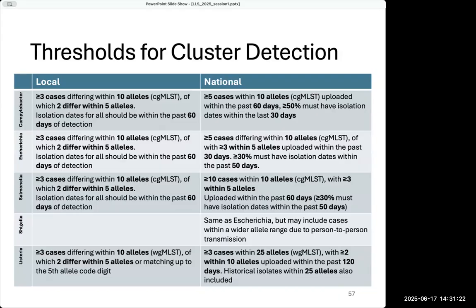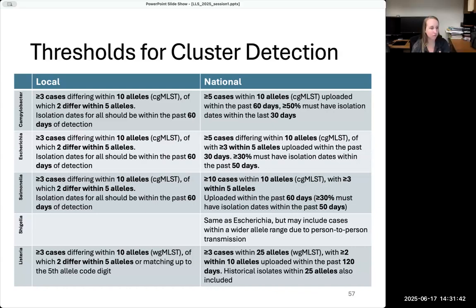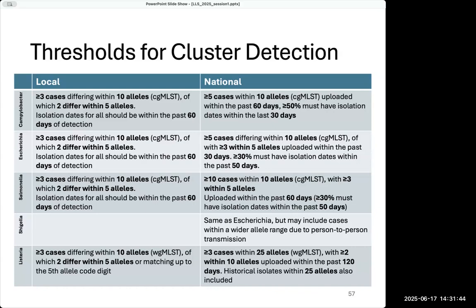Hey, yeah, I actually have been answering very similar questions just about different pathogens and serotypes. Pretty much, I would say prioritize anything between 0 and 5 SNPs. That's usually what I think. I know the study that you're talking about, and that's what they reference in terms of finding outbreaks and epi data linking the isolates that were between 0 and 5 SNPs. Anything more than 5 SNPs is a little bit sketchy, I would say. Important, but not super urgent. And anything greater than 10 SNPs is more like curiosity.